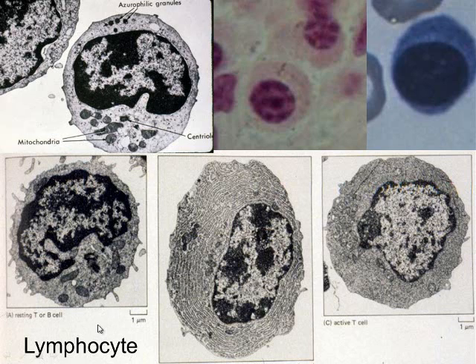Now those lymphocytes, as we see one here and one here, could be T or B. If they're T cells, they become active, and it could be helper cells, it could be memory cells, but they also could be cytotoxic killer cells. So T cells become the killer cells that actually kill things, as opposed to the B cells, which become plasma cells. So these transform into plasma cells.